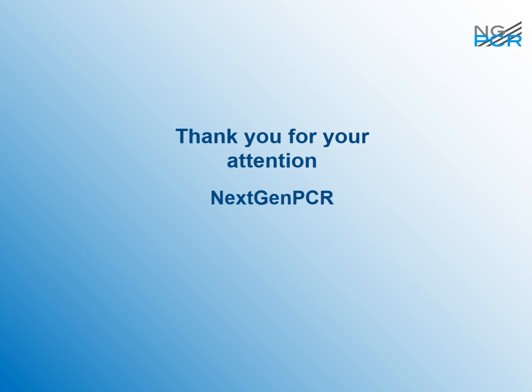Next one here, is there a specific chemistry that needs to be used with the instrument? No, actually not. It's the standard PCR chemistry that you use. But if you want to go fast, you need to use an enzyme which doesn't use a lot of time to activate. So if you want to use a hot start, use a hot start that can activate in 10 seconds or so. I know that manufacturers say that you need 30 seconds or 60 seconds, but I think they want to stay on the safe side. Our experience is that usually 10 seconds is enough to activate the enzyme. And then it's just a matter of the standard buffers that you get from your manufacturer or that you make yourself and you're used to using, and that's it. Okay, brilliant. Thank you.